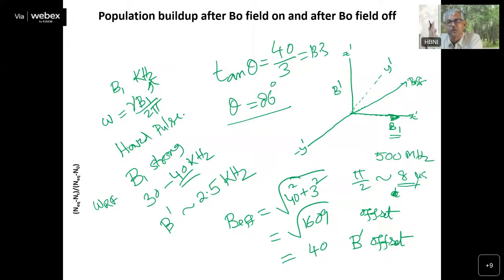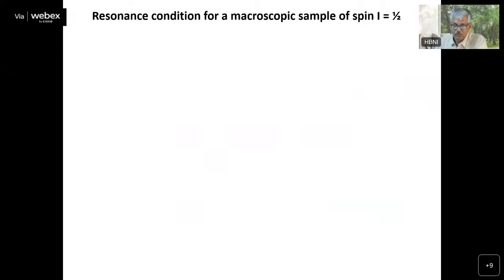So you can find out from this 8 microseconds. It is 10 to the power minus 6, so it will come around 20 to 25 kilohertz. You can get a frequency uncertainty of 20 to 25 kilohertz, so that covers your entire spectrum many more times. I'll show you.